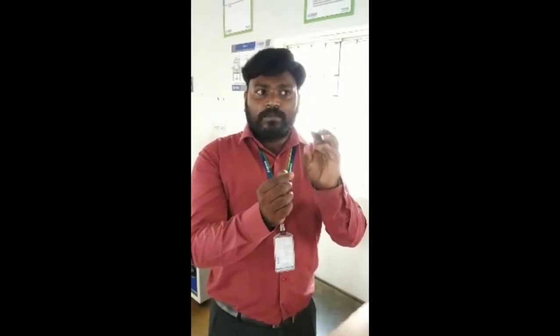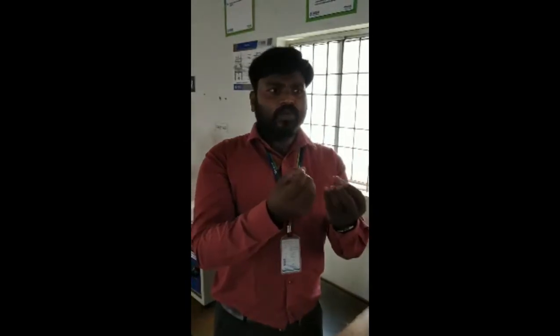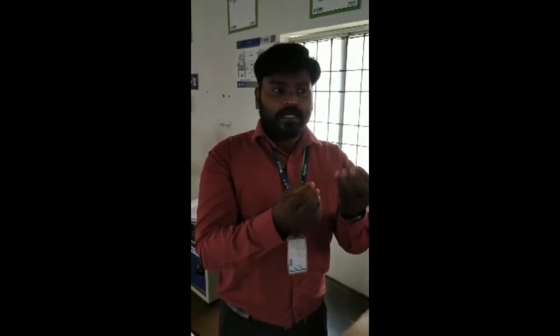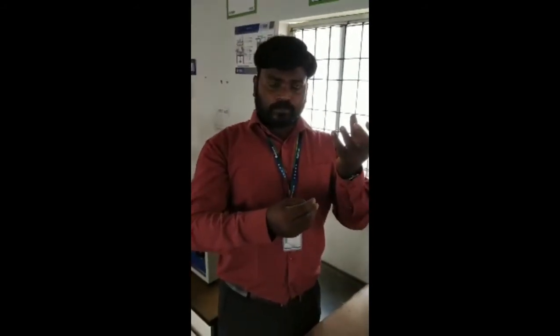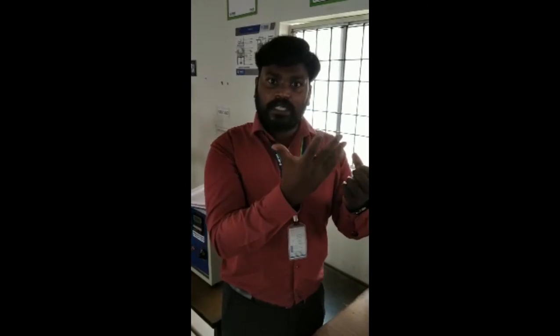At one point of time, there will be a flash. It won't fire or burn, but a small flash will appear. That particular temperature is nothing but the flash point. Slowly, if you continue to supply heat, at one particular point it catches fire and starts burning. That point is nothing but the fire point. You have to note down the reading at that point. So this is the flash point and fire point.